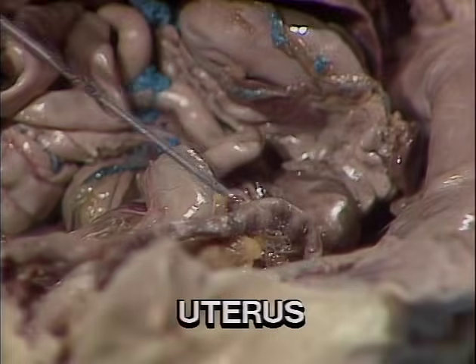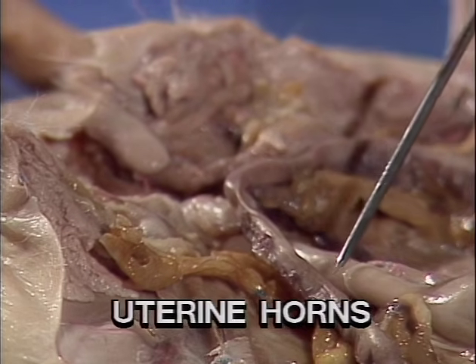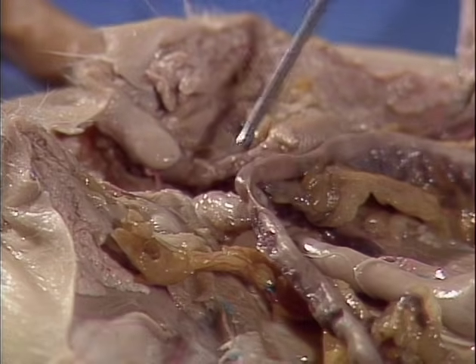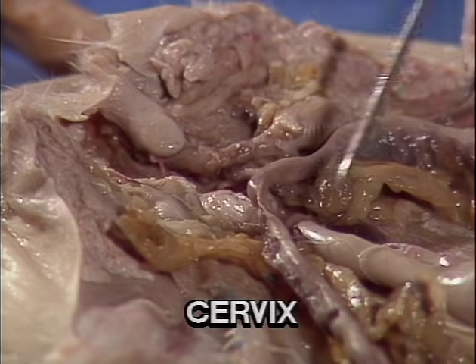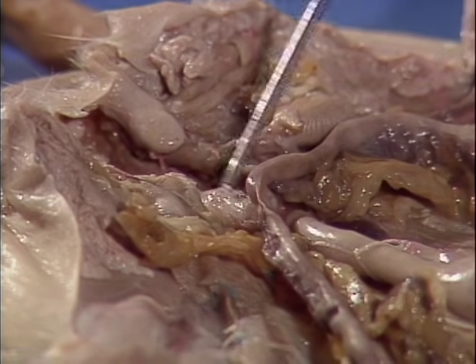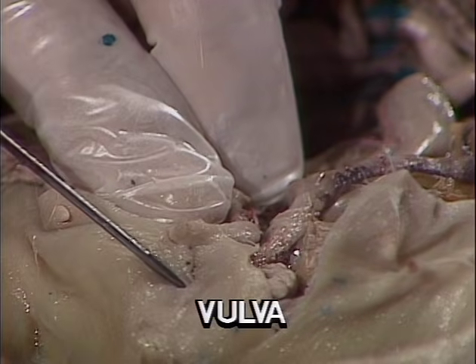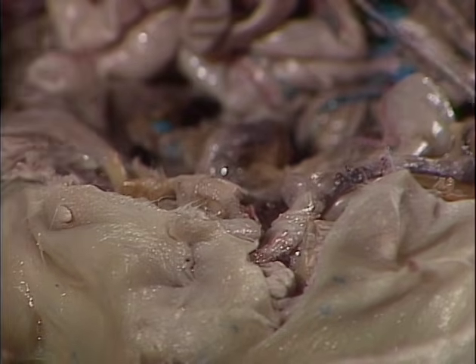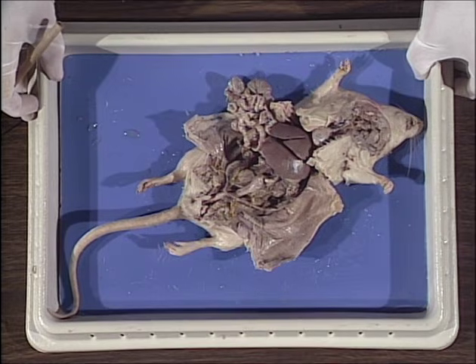The uterus in the rat is branched to form two uterine horns. The opening from the uterine horn into the vagina is known as the cervix. The egg would follow from the ovary, the oviduct, down the uterine horn, into the vagina, and out through the vaginal orifice known as the vulva. The purpose of the uterine horns is to accommodate multiple births.